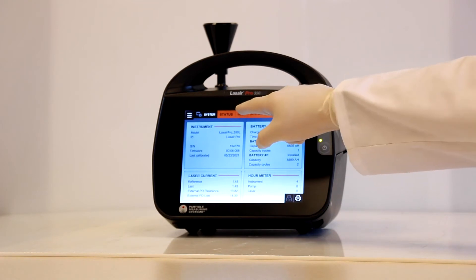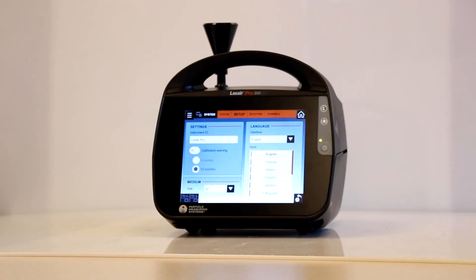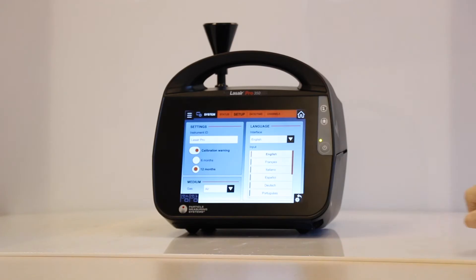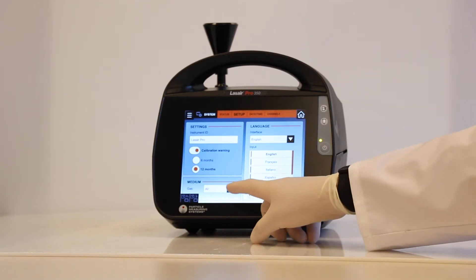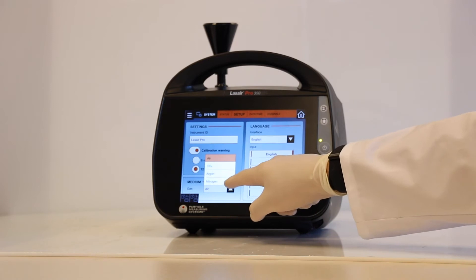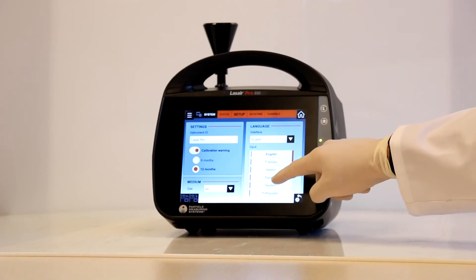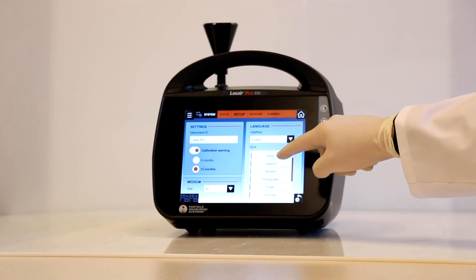we can configure the LaserPro with additional settings such as giving the unit an instrument ID, setting up a calibration warning, setting the medium which we will be sampling, and setting the language on the unit.